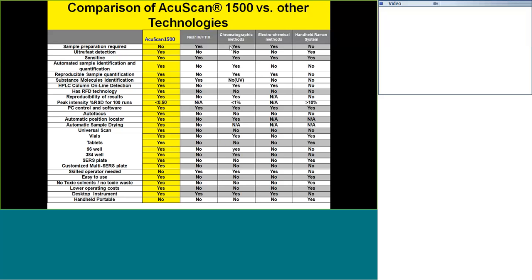So in a way, HPLC, again, is the best technique for analyzing complex samples. Say the sample has 20 components in it, or 100 components, or 1,000 components. You can use HPLC columns to separate them and identify them with UV and then with mass spec. Raman is the best in terms of cost, simplicity, easiness and reliability for handling simple mixtures like drugs, like pigment, food additives.